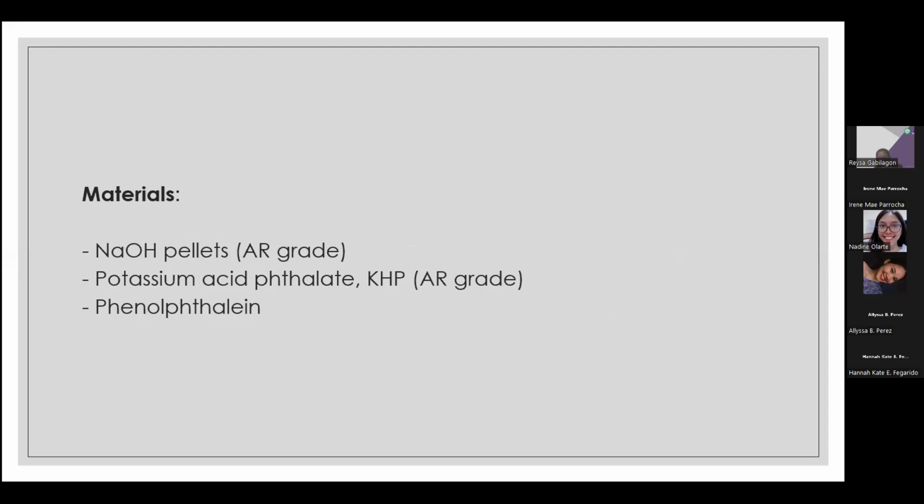Next, please. The materials to be used: first is NaOH pellets. Second is potassium acid phthalate. And last is phenolphthalein. Thank you. Next, please.